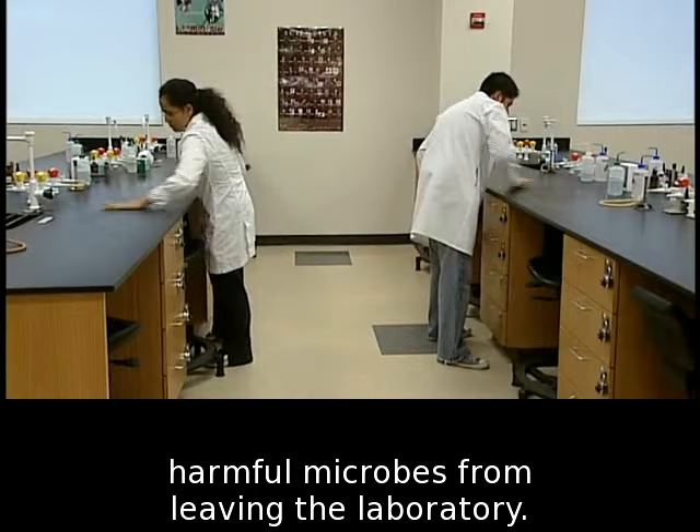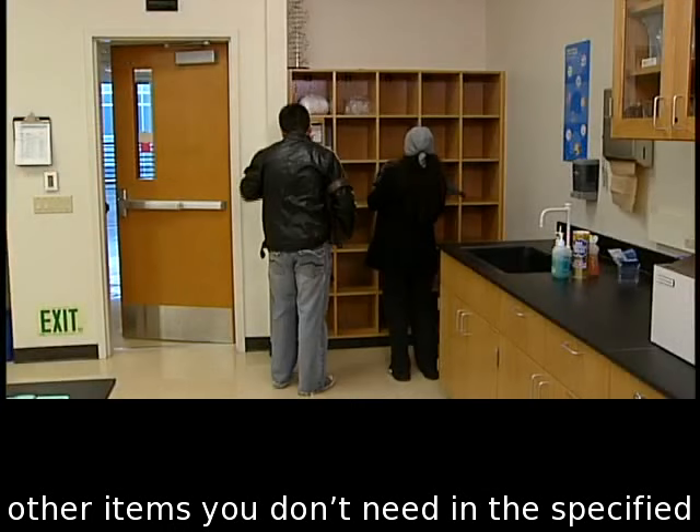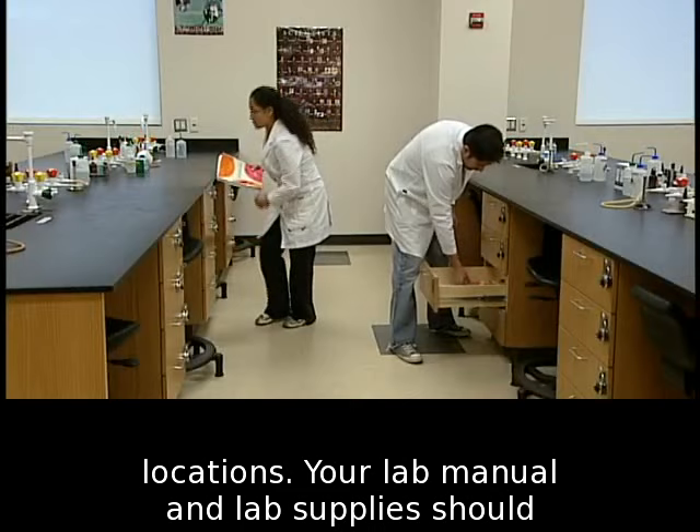When you enter the lab, place coats, books, and other items you don't need in the specified locations. Your lab manual and lab supplies should be the only things on your lab bench.